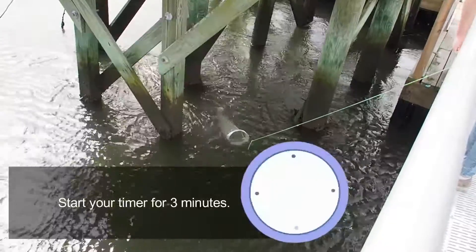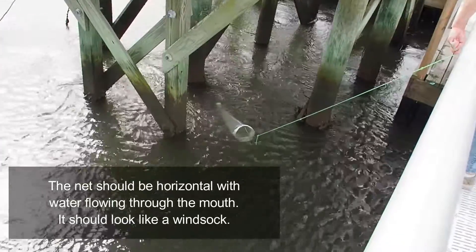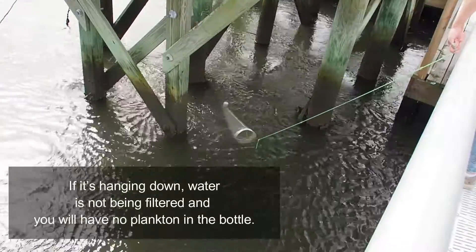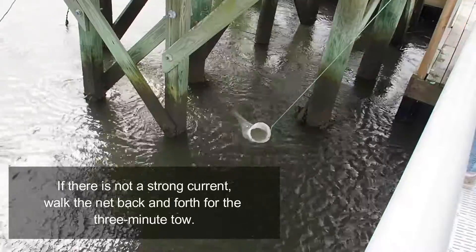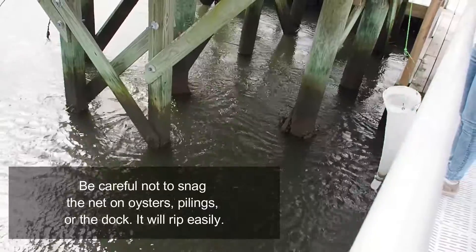Start your timer for 3 minutes. The net should be horizontal with water flowing through the mouth — it should look like a windsock. If it's hanging down, water is not being filtered and you will have no plankton in the bottle. If there is not a strong enough current, walk the net back and forth for the 3-minute tow. Be careful not to snag the net on oysters or pilings of the dock — it will rip easily.